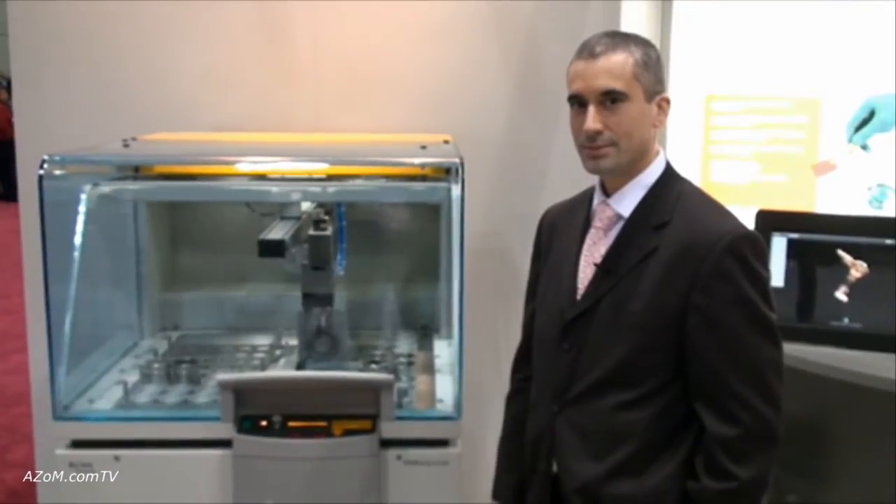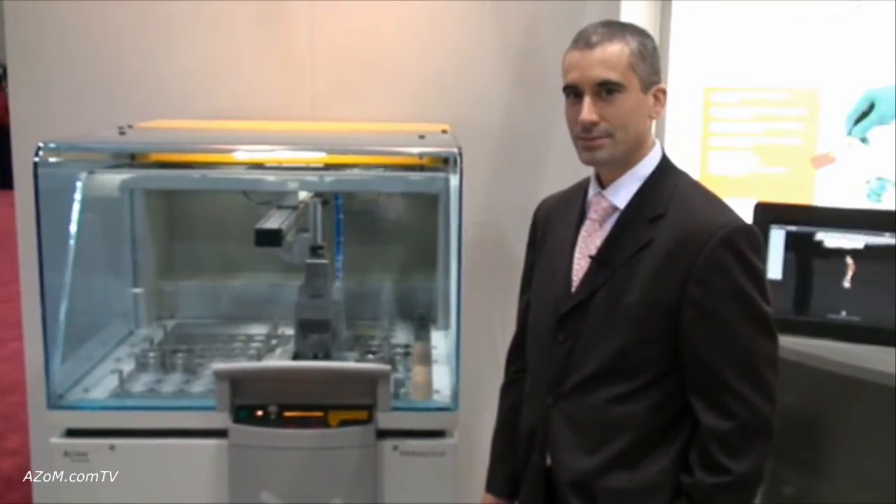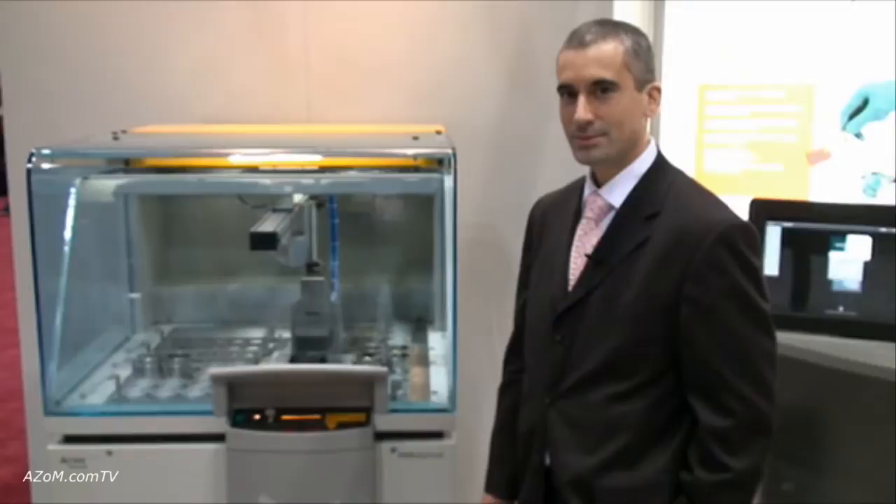This is Cameron Chai from azom.com and I'm speaking to Dave Collar from Panalytical, and he's going to show us through the Axios XRF.